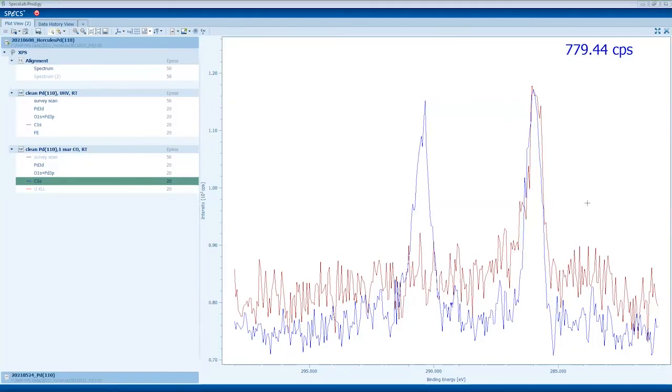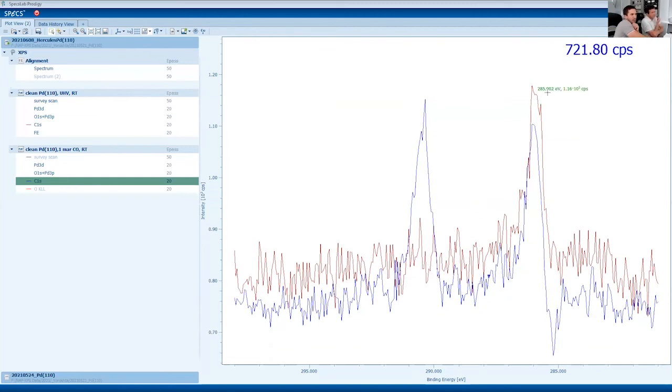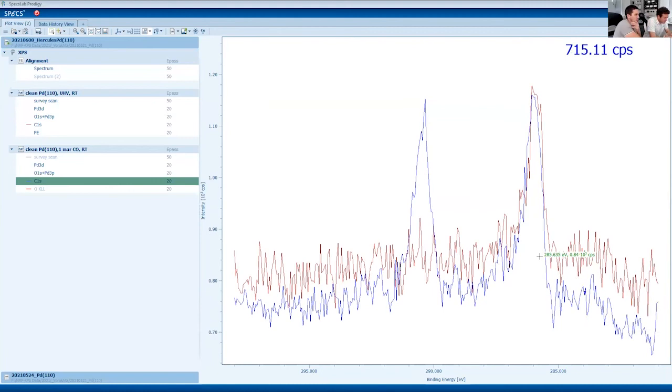Now we have to discuss whether we are just finishing, or we try to heat it up to see. So actually now we should decide. This is how usually this experiment works. Of course, this data does not have much sense, I guess, but anyway it was just to show how to do this measurement. You see here the gas phase. Normally you have some peak from the adsorbate. However, on the clean surface we already had some peak, so the change is not so big.